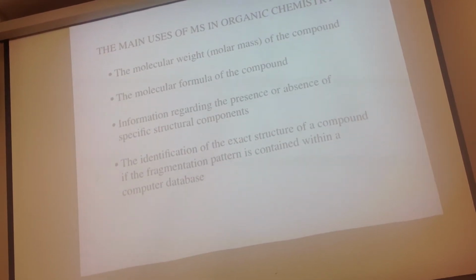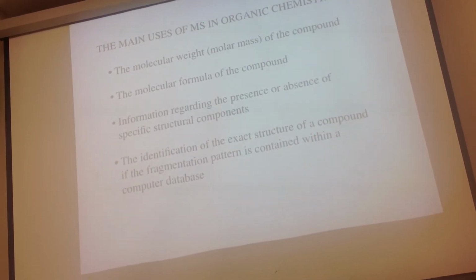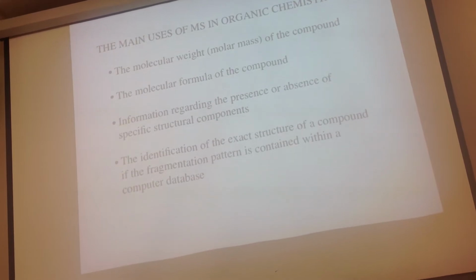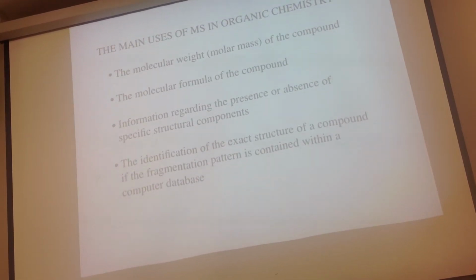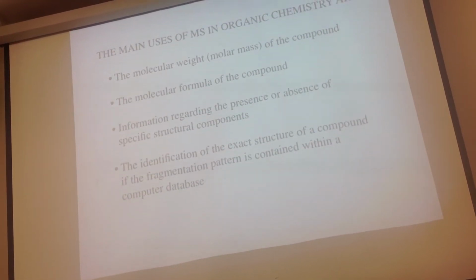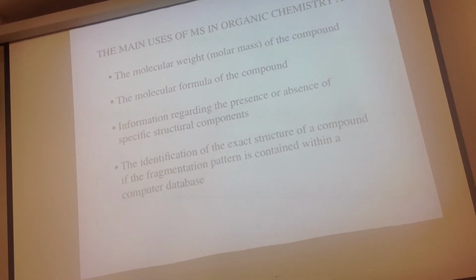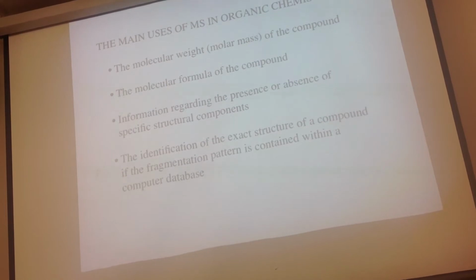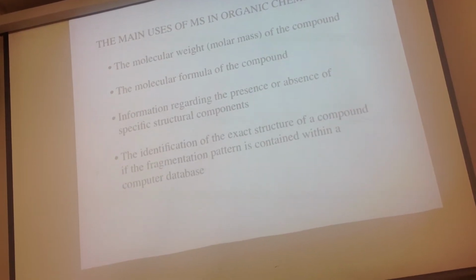Sometimes it doesn't. You can get the molecular formula of the compound. Your book goes through this process that some people were asking about today, where they give you just the mass spec and say, what's the formula? And it's kind of complicated. When you go through the reading, it's interesting. I'm not going to have you do that, but you can do it. I'm more likely to say, here's the formula, here's the mass spec, what's its structure, which you can get fairly easily.